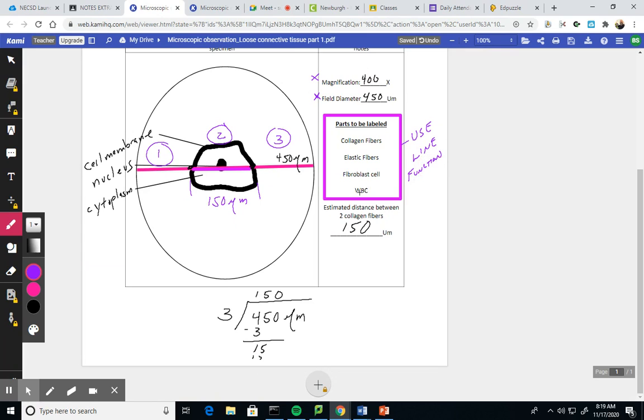If you're not using CAMI still, you're going to have a very difficult time doing this. And the line function is here under shapes. It's under shapes. And then again, once again, estimating the sizes of whatever I asked for using this method.